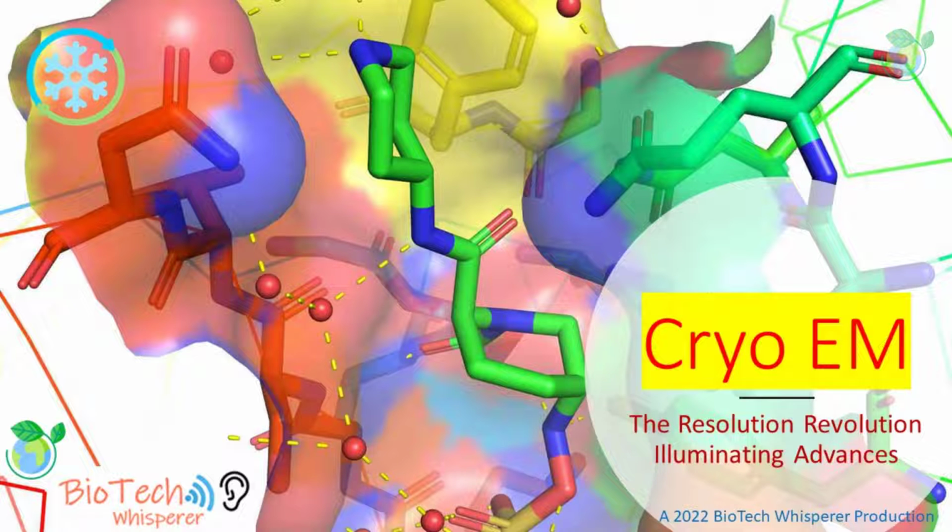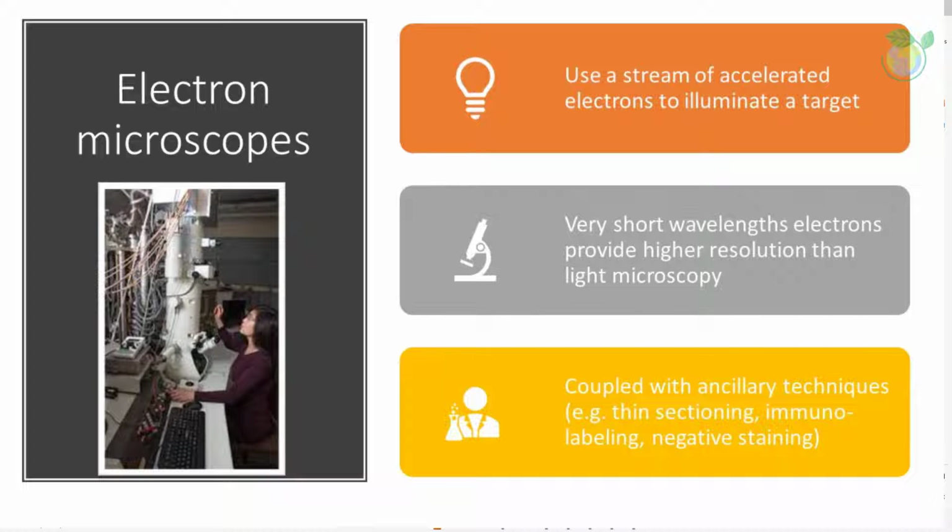The usage of electron microscopes, or EM, which use a stream of accelerated electrons to illuminate a target, provides a better resolution than a light microscope. It is used in biomedical research to investigate the detailed structure of tissues, cells, organelles, and macromolecular complexes.